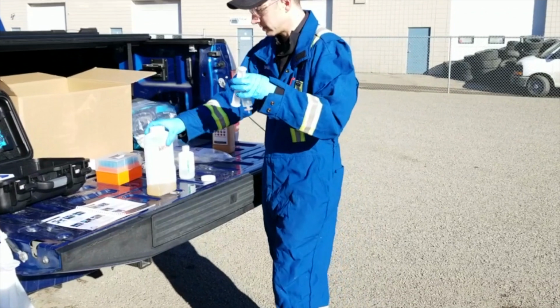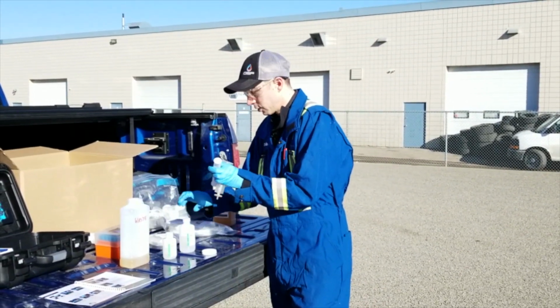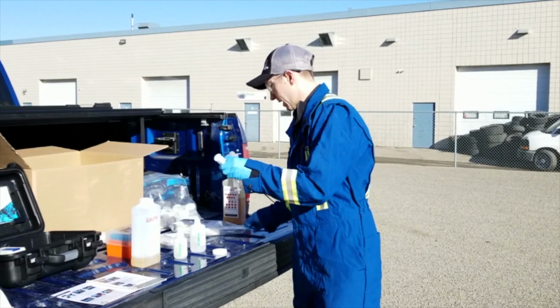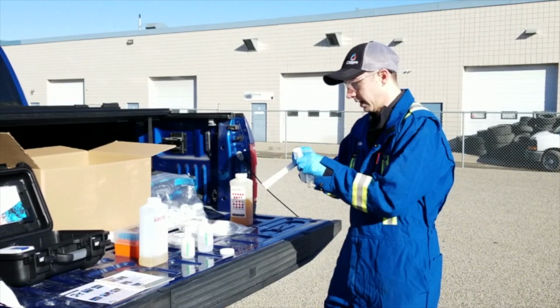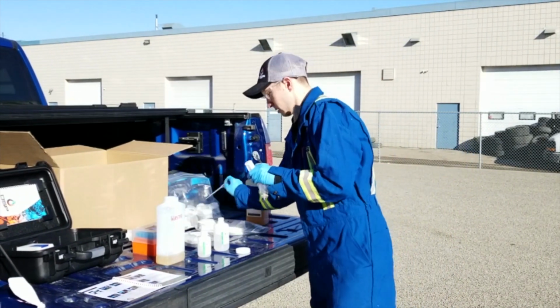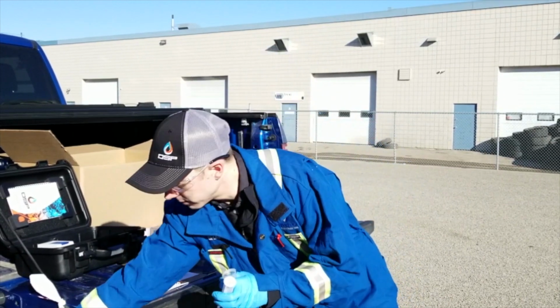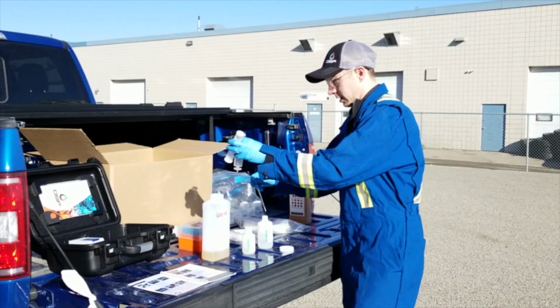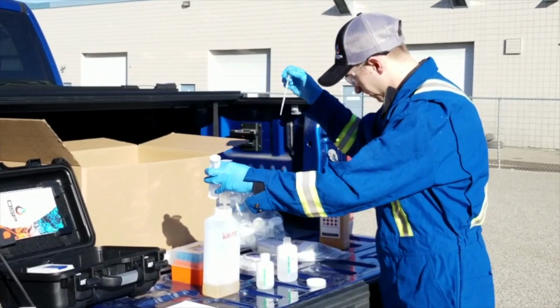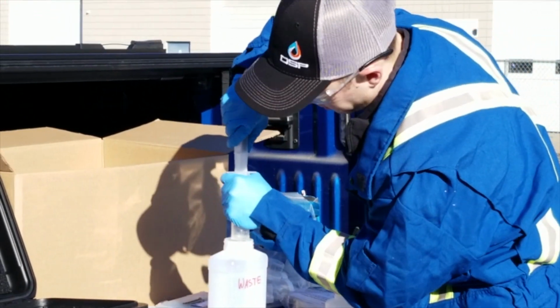Now what we're going to do is rinse the filter just to get rid of any kind of salinity, oil skims, anything that can interfere with our Photon Master in reading the light that's produced by the ATP and the enzyme. So we're going to use a bulb pipette. We're going to go 1 squeeze of our rinse reagent and put that right into our syringe with the filter on it. Tap that back off, and we're going to filter this through.